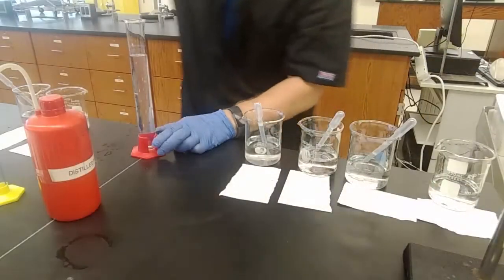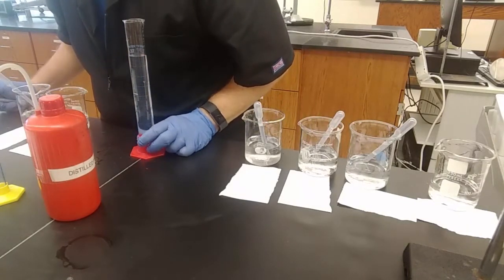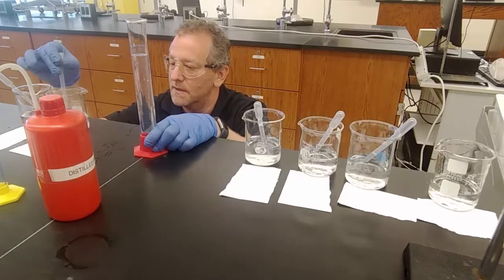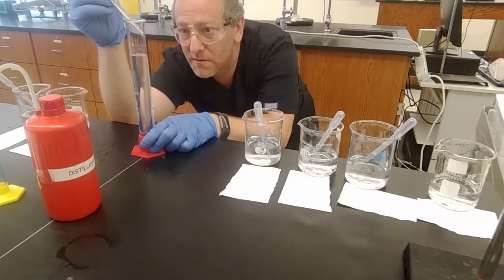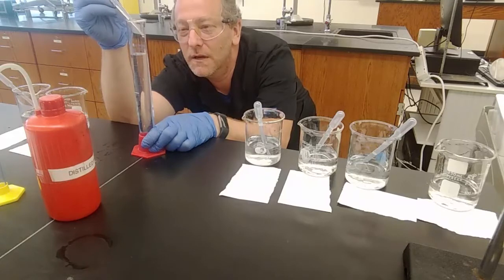Let's get our 1 milliliter of 13. 1 milliliter of 13. Make sure it's stirred really well. I'm sure it was, in the graduated cylinder, pouring it in, but we'll just make sure. 1 milliliter of 13. Like how I caught myself there. Into here.